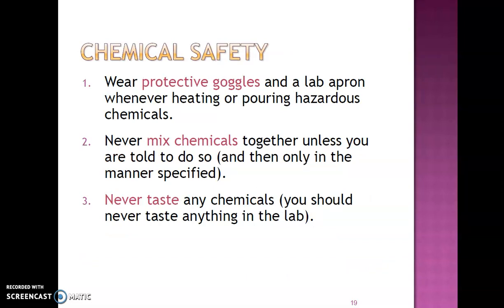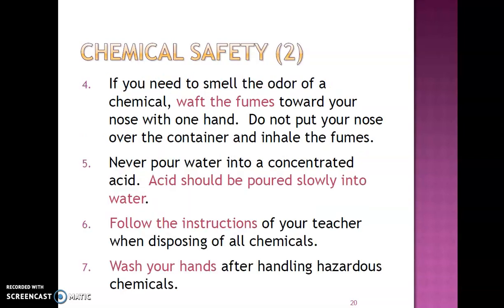And chemical safety part. Wear protective goggles and a lab apron whenever heating or pouring hazardous chemicals. Never mix chemicals together unless you are told to do so, and then only in the manner specified. Never taste any chemical. You should never taste anything in the lab.